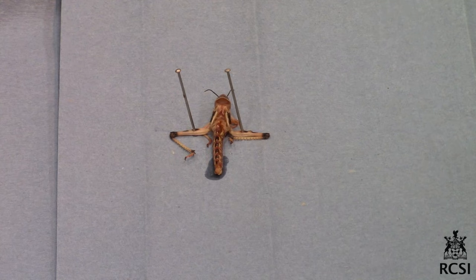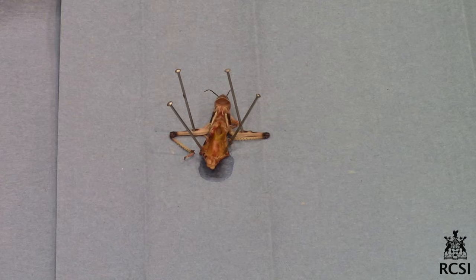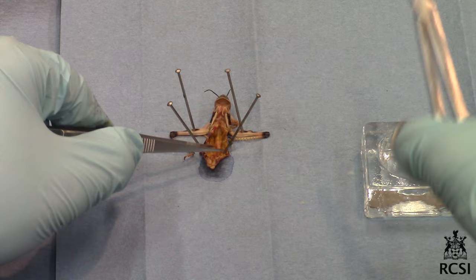Dissect the insect abdomen from the dorsal side. Remove the testes, which should be separated from the covering of fat.